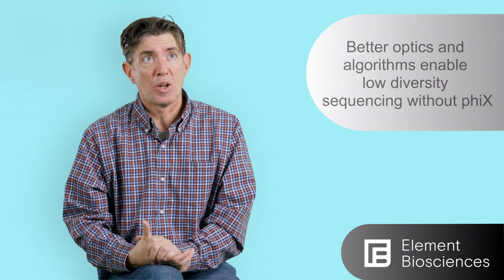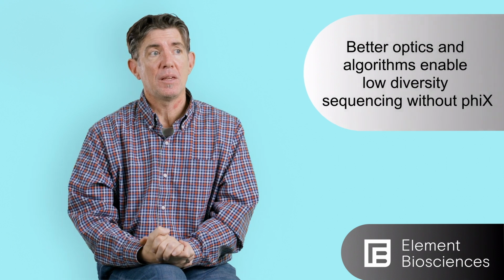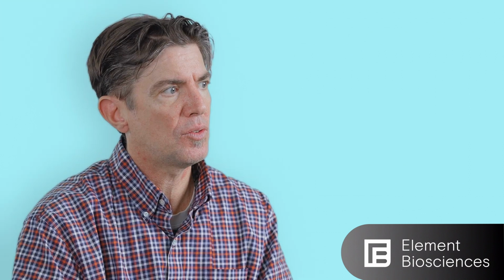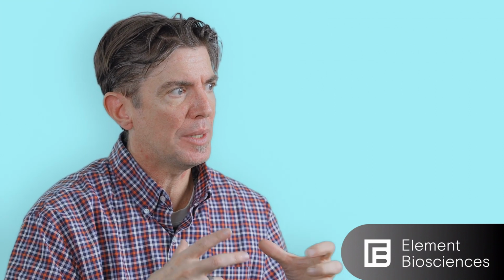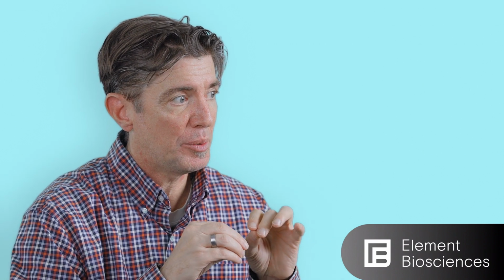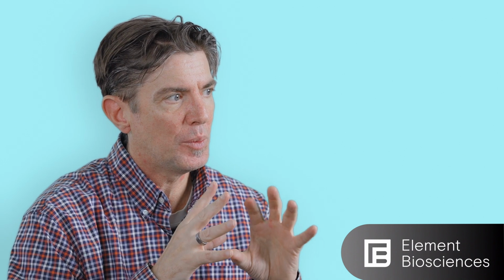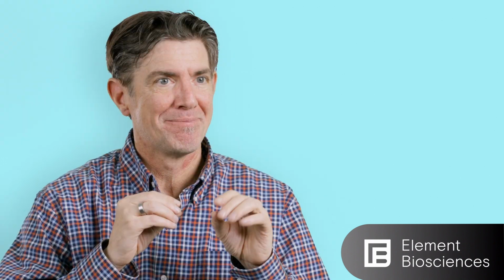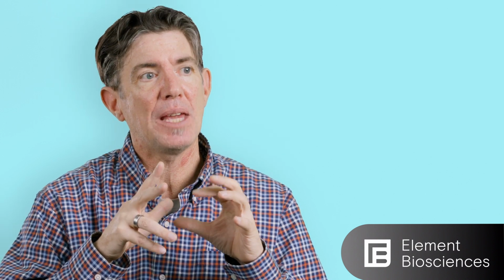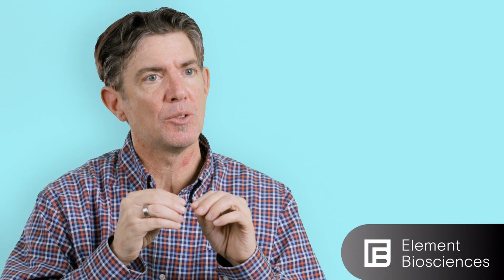The first problem to solve when trying to discriminate the polonies when you're imaging them is really to understand and classify them according to their color. It's easier to do that when you have an algorithm that allows you to get higher density information and discriminate position from position. And it's also easier to do that when the colors don't overlap. As those colors start to become the same in kind, it's harder to tell one position from another when they're very close together.